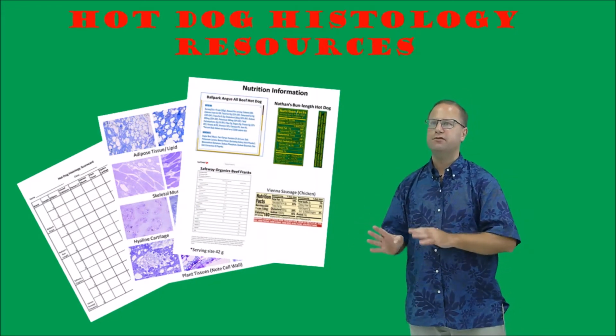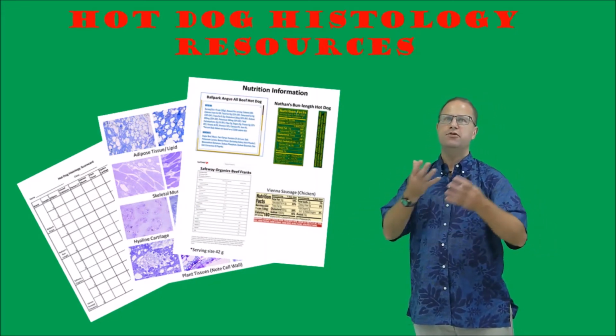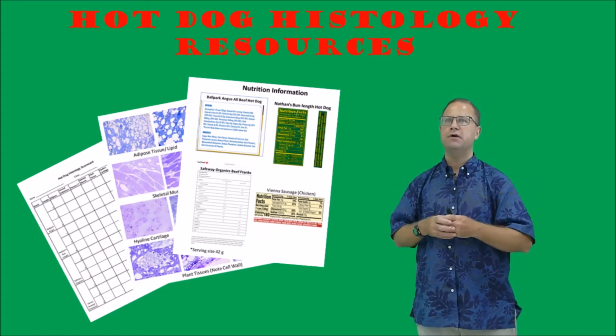Next up, we have nutrition information for each of the hot dog brands, and this is important because maybe you want to do a comparison between your estimation of the amount of adipose tissue and the amount of fat that the hot dog is purported to have.